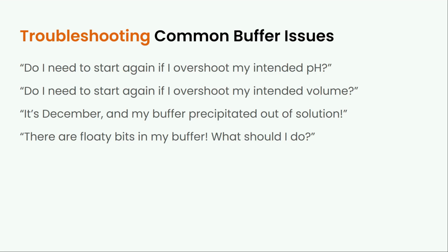And if you think about it, our buffer solutions are usually pH'd to somewhere near physiological pH, and there's usually a nitrogen source and a carbon source inside them. So things love to grow. If you're in a bit of a pinch, you can just filter the buffer under a vacuum pump with a nitrocellulose filter and sterile filter it, but it won't capture everything, and you can guarantee the things will regrow.